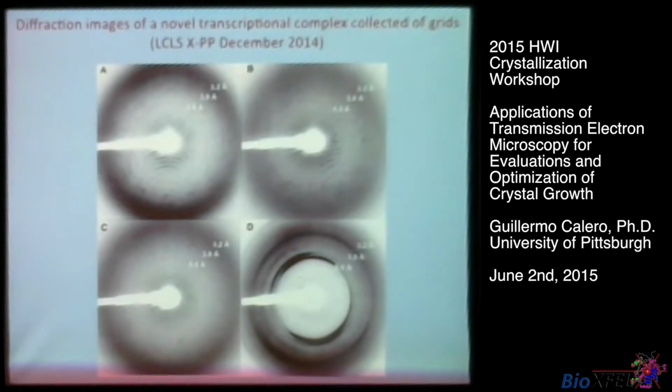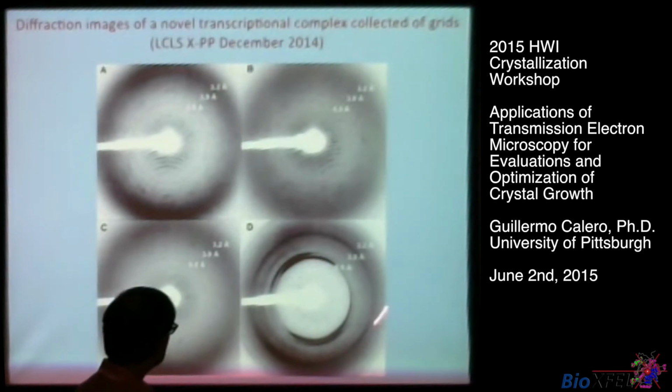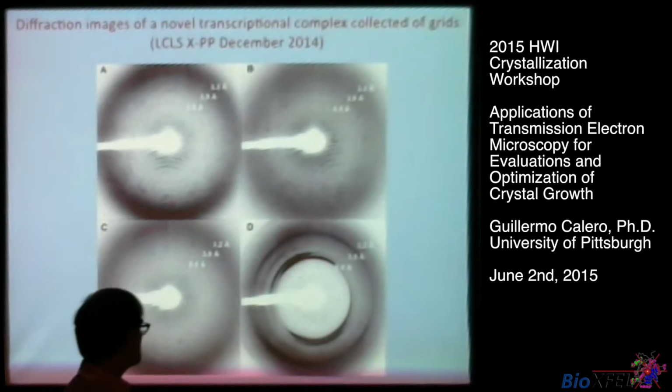These are the results of those shots. You can see this was polymerase, and you can see spots of 2.9, which is actually quite good for one of our complexes. And this is a shot on the Mylar loop, which is the third generation of loop that we use, actually made out of Mylar. And you can see the background of the Mylar.